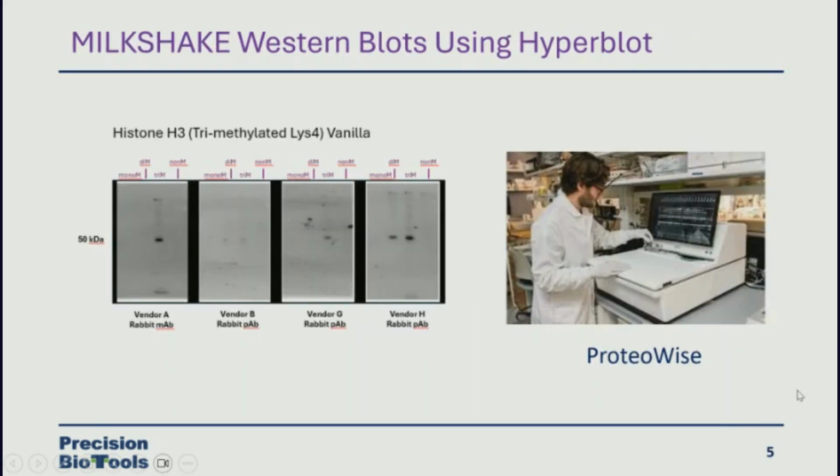Having said that, we also use a machine that's also made in Brantford called ProteoWise, an automated Western, and we've been playing around with that to see if we can get this to work.